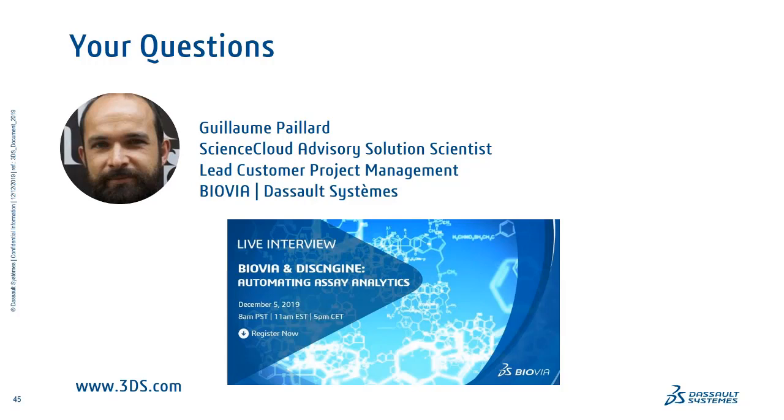So again, it's coming back to that second point about data integrity. The fact that assay is available in the cloud allows you to promote that data integrity to your partners, and this is, to me, the key point for questions around externalization and collaborations around screening assays.